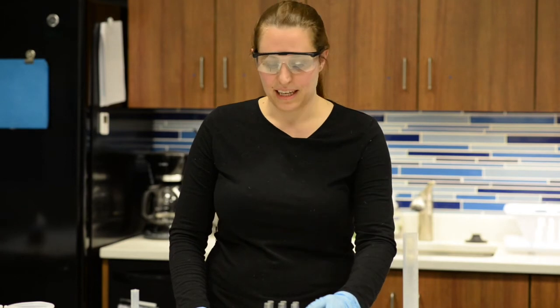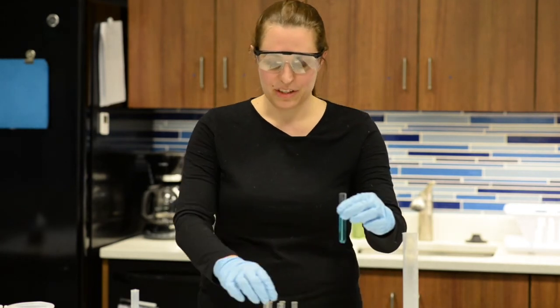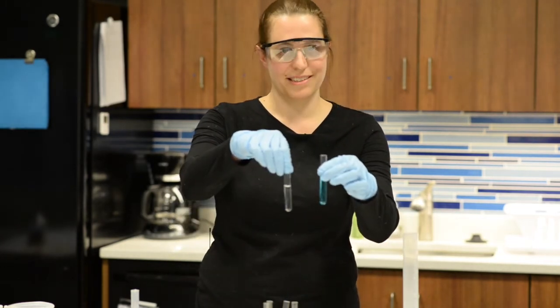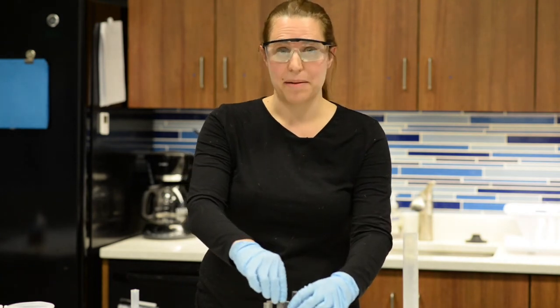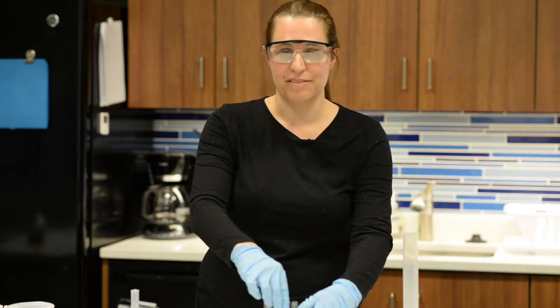As you can see our tube that had protein changed color while our control stayed the same. To find out more about this lab and other online courses we offer please visit www.mghihp.edu slash science.